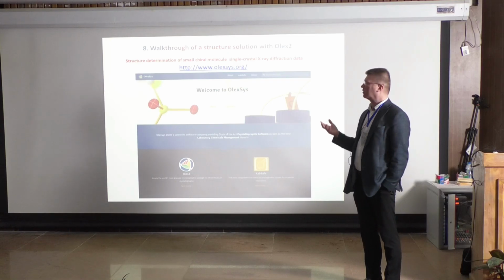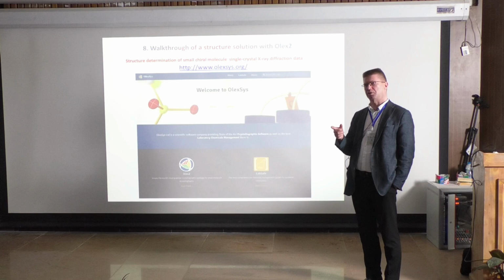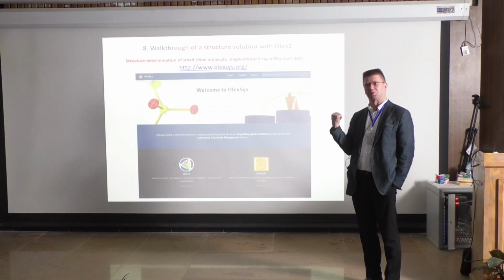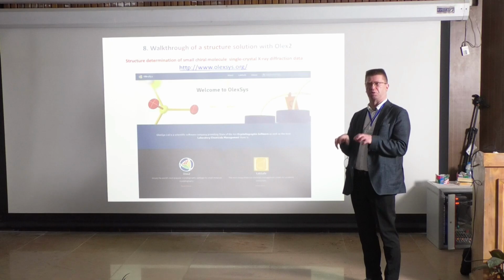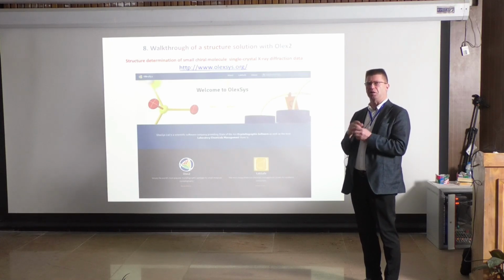And there are other programs inside this Olex2 that I'll show also, and we made it so that they will be available to you. We'll make a link. They're quite big, but you can do it easily and they're really easy to install. So you can install these programs on your own computer and do the work based on this. Because you will also get the data. So you get exactly the same thing, and you can repeat what I'm doing here. You can do it at home with your own computer. And that's the essence in that sense.